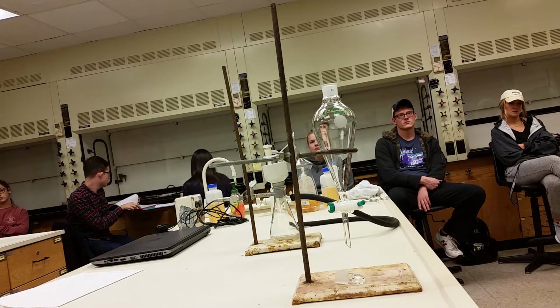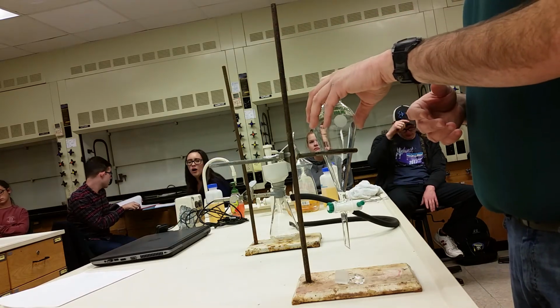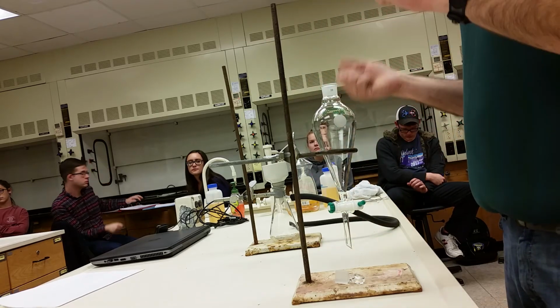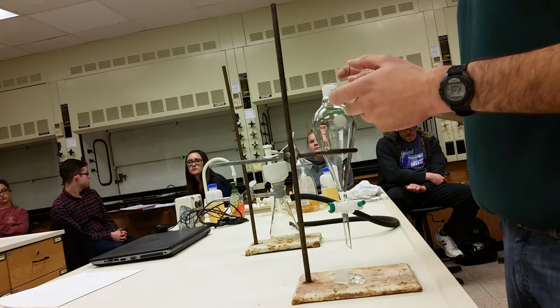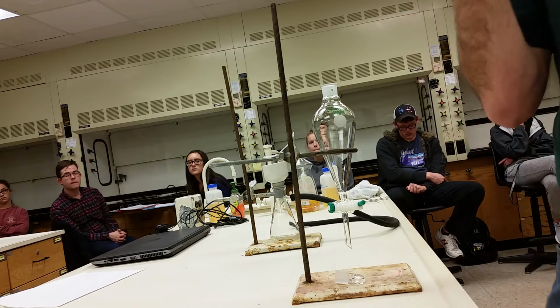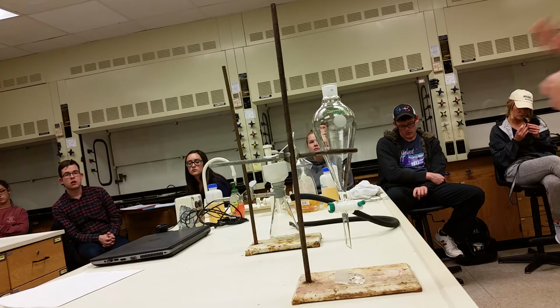You're going to then take 10 milliliters of bicarbonate solution in here again. Put the cap on. Shake it. Vent. Shake. Vent. Shake. Vent. And do the separation 3 times. You're going to use 3 portions of 10 milliliters of sodium bicarbonate, which means you'll have to use a total of 30 milliliters of the 10% sodium bicarbonate.